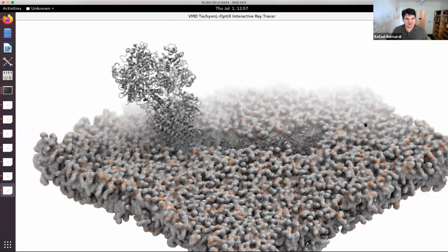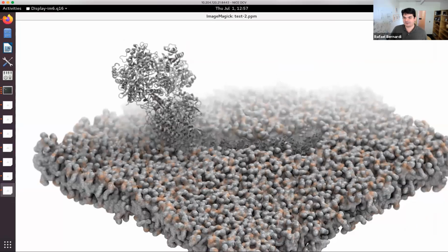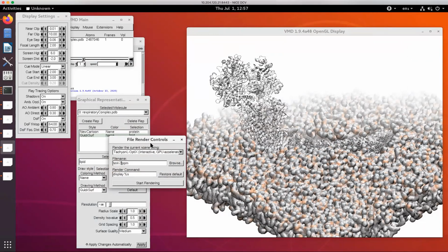As you can see, some things are in focus now and some things are out of focus, because what I did was turn on the depth of field. I turned on this last option here, which is basically like if you have a professional camera and you're trying to focus on the system. You can have how much of the image is in focus, how much is off. Show them a real-time scrub so they can see. I'm going to do that as soon as I change one other thing.